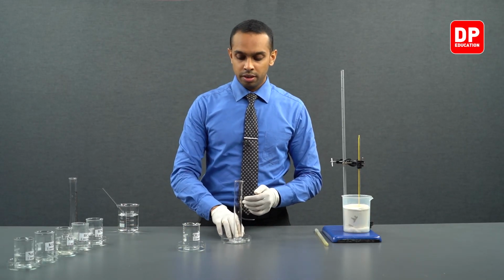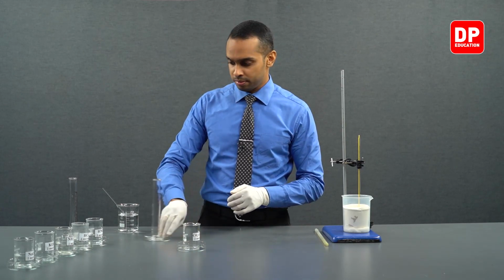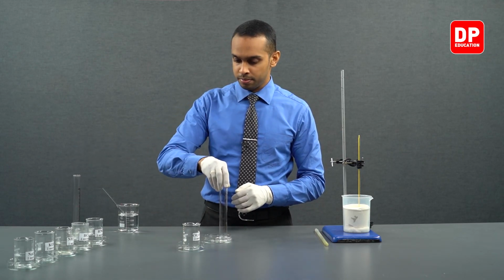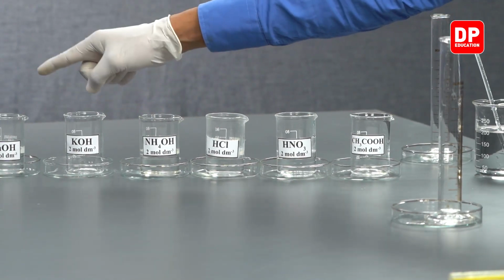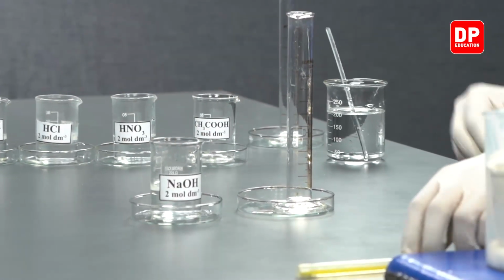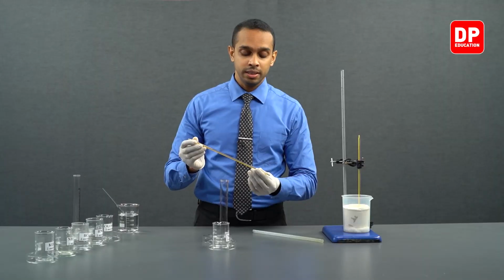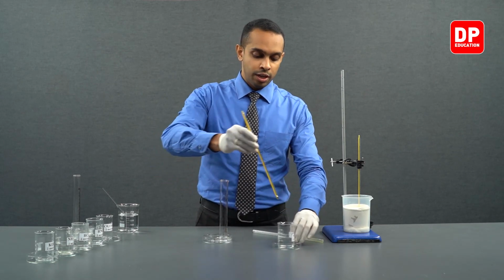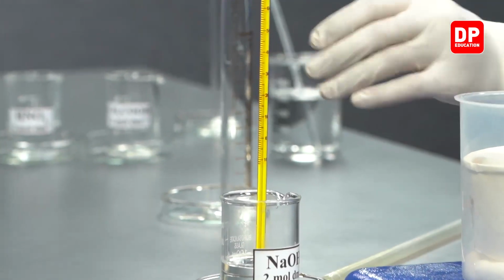Now let's measure the temperature of the base as well. We will be using sodium hydroxide as our base. Let's take the base here, and we are going to use a different thermometer which has been washed since the last time we used it, and we are going to measure the temperature of the sodium hydroxide as well.